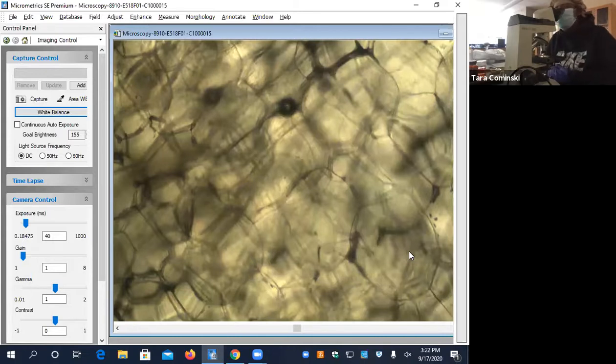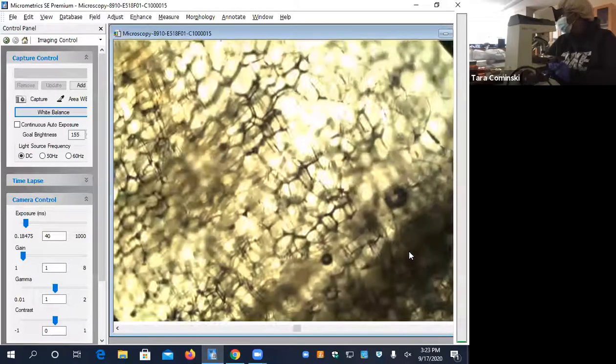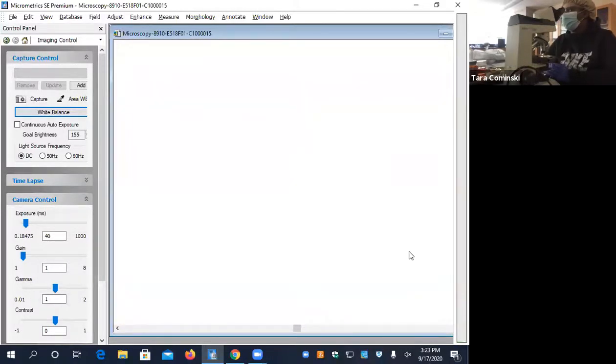But let me show you one other thing. There's a slide that was lying around of a cerebellum. That's the back part of your brain. You can take out a mouse or rat brain, section it very thin, and then stain it. See how this is a super dark stain? Our stain was stinky.